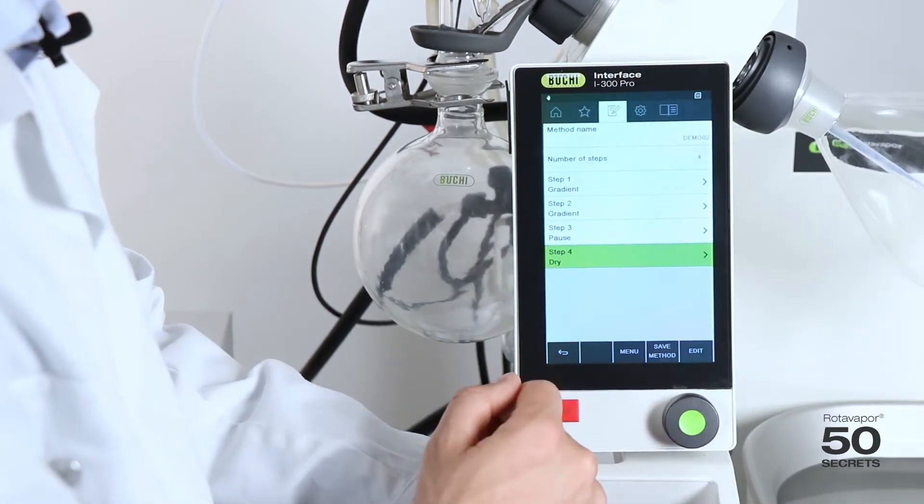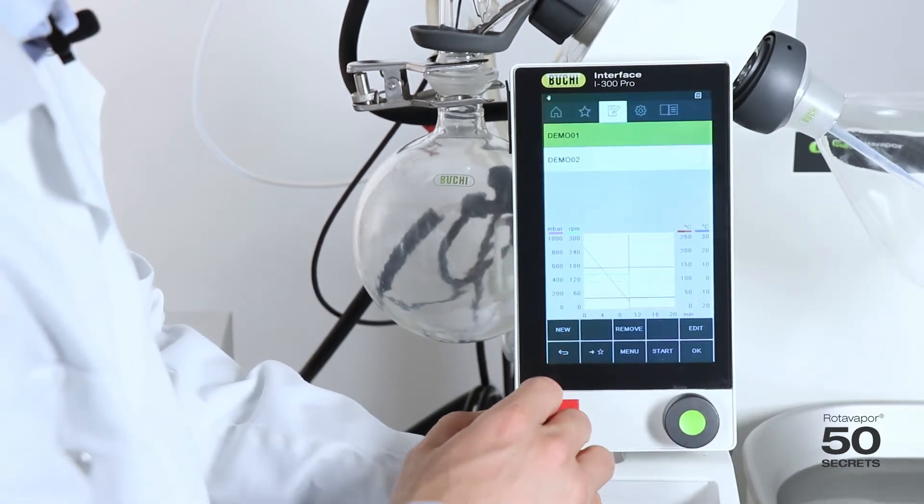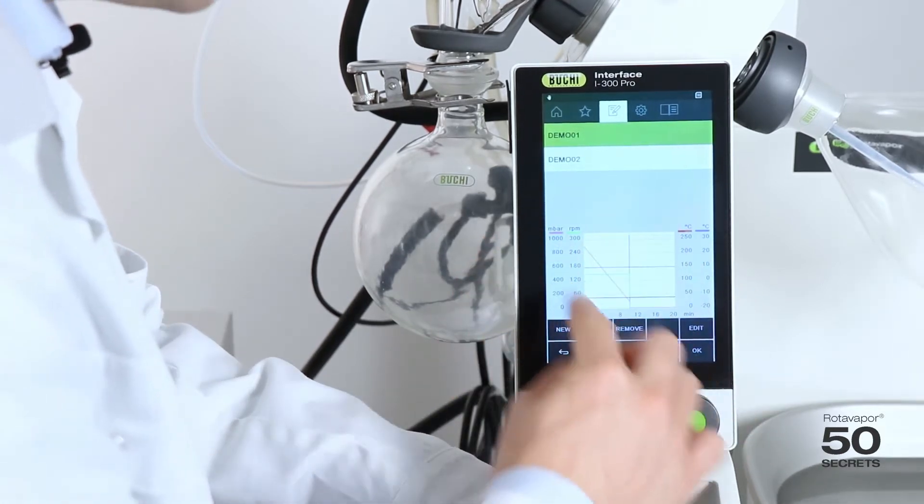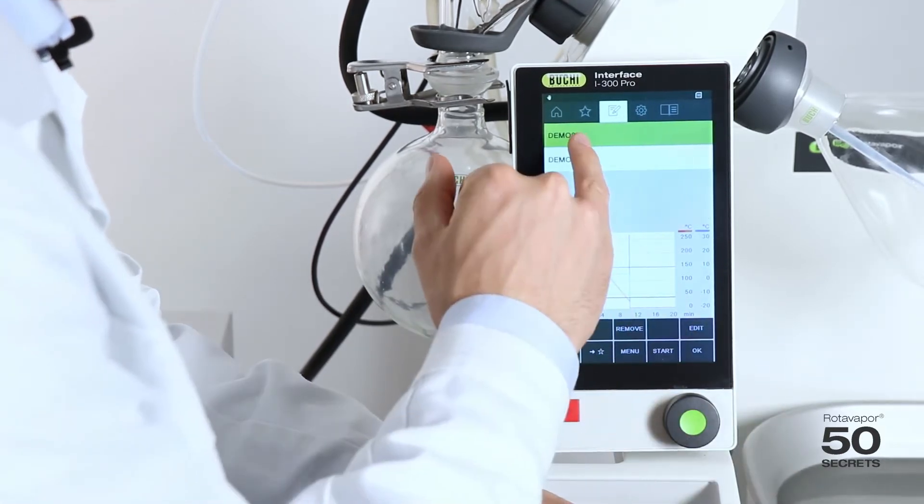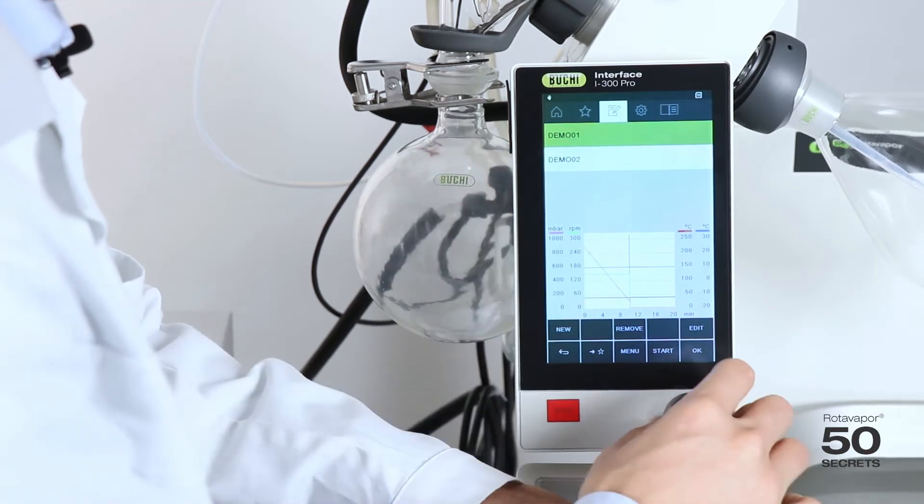So now we have created the whole method. We can save it. And now one thing we can see is over here we have already a preview. So we have demo1 and we switch to demo2, the method we've just created.